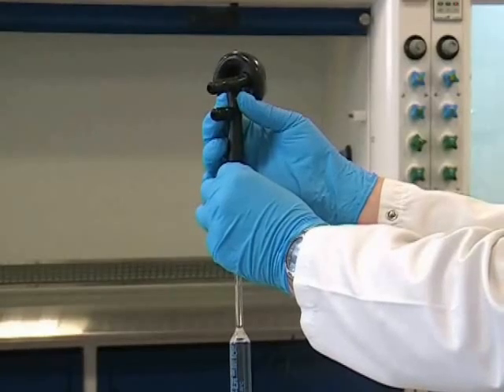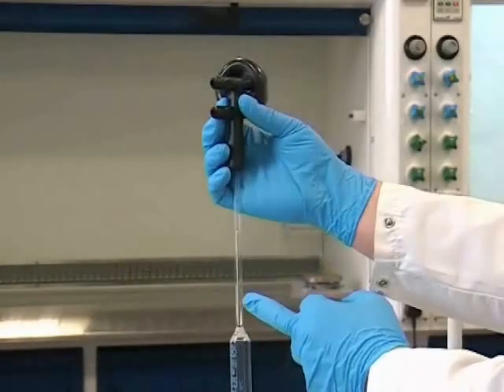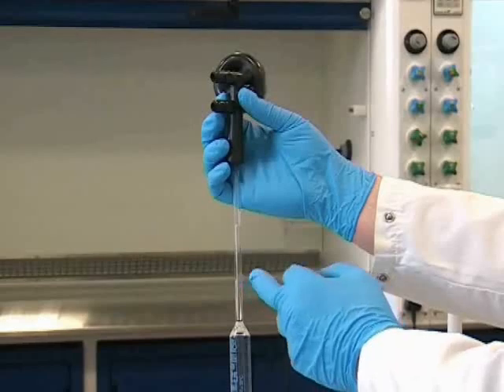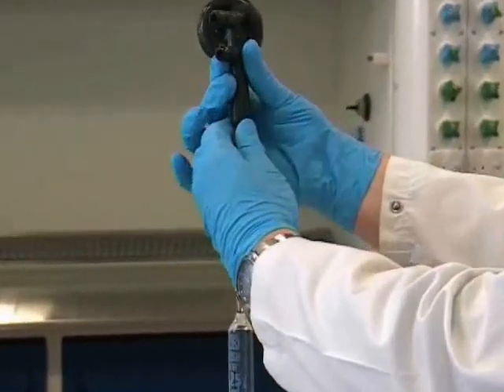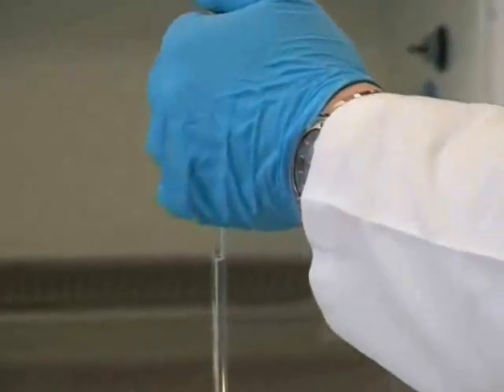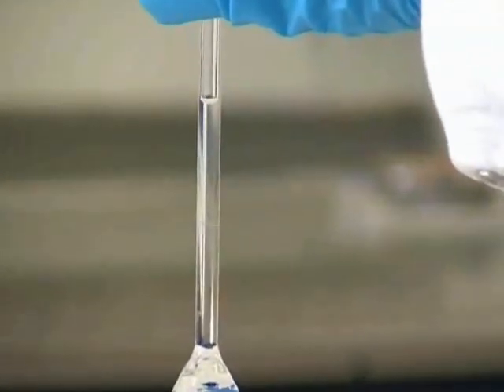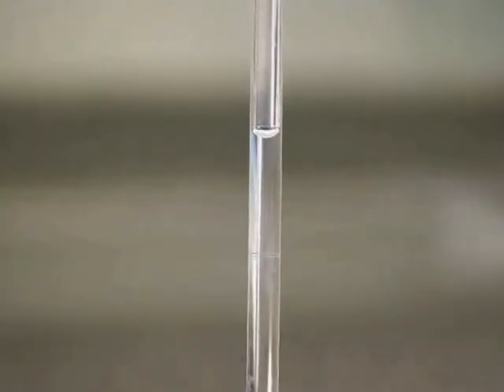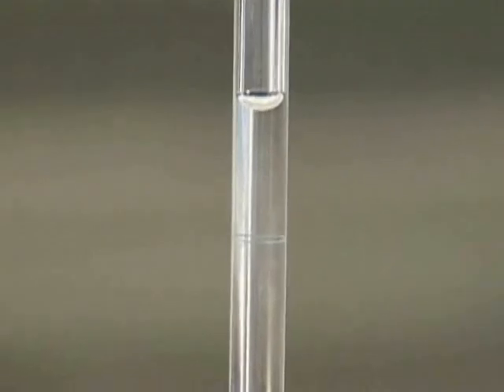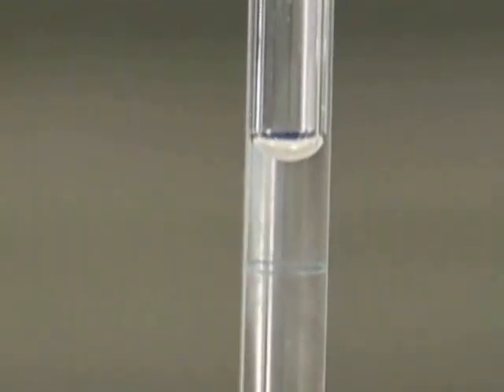Initially we're going to take more solution than we need. Here you can see the line on the pipette and the solution is clearly above that. Now we can gently remove the rubber bulb and place our thumb over the end of the pipette. By gently moving our thumb we can release the solution in a carefully controlled manner until the bottom of the meniscus is touching the line on the pipette.